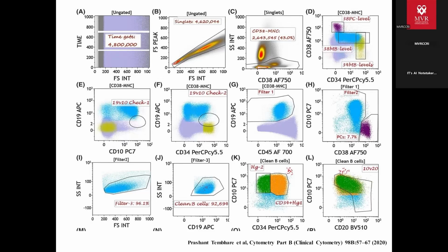So our strategy is that we will select out the CD19 positive cells. CD19 marks the B cells; B cells uniformly express CD19. So we will purify out the myeloid cells, the plasma cells, and all the other cells we are not interested in, and we will take out the CD19 cells. These CD19 cells are put in this hematogone template, where the normal hematogones lie. Then we'll see if there is any population coming outside the template of hematogones.